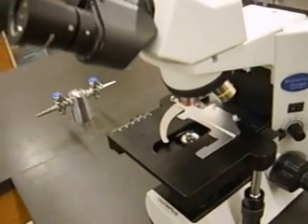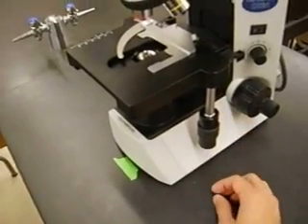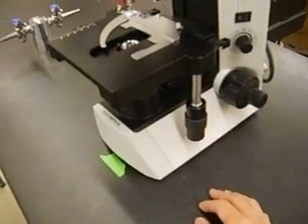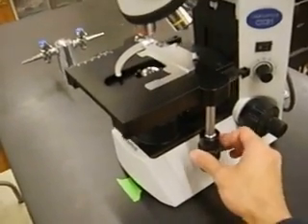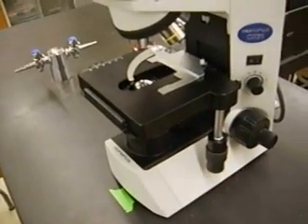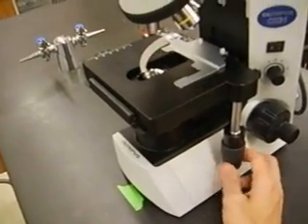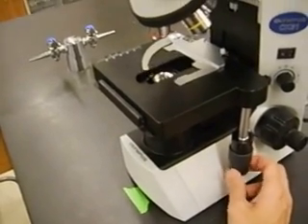Some other knobs you'll use a lot are the stage movement knobs. There are two sets — a top one and a bottom one. The top knob moves the stage forward and back, while the bottom knob moves the clips that hold the specimen, shifting them from side to side. You'll be using those a lot this quarter.